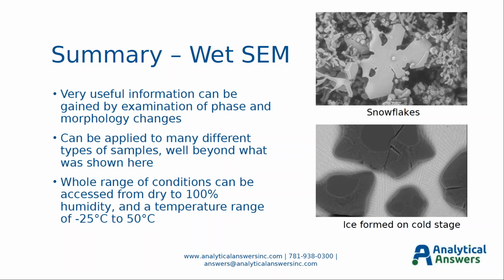Just for charge neutralization alone, there's a very large list, but there's so many different types of materials where looking at them in their natural wet state is a benefit over drying them down for a normal SEM, because they lose a lot of their information if you have to go through such an extensive sample prep to dry them out. And of course, we can access a whole range of conditions from dry to 100% humidity, and also a very wide temperature range in combination with the wet or just by itself.